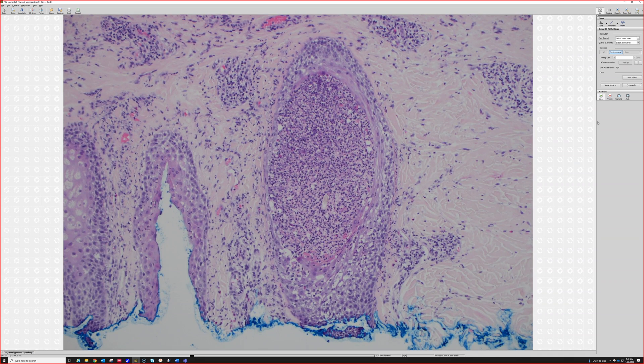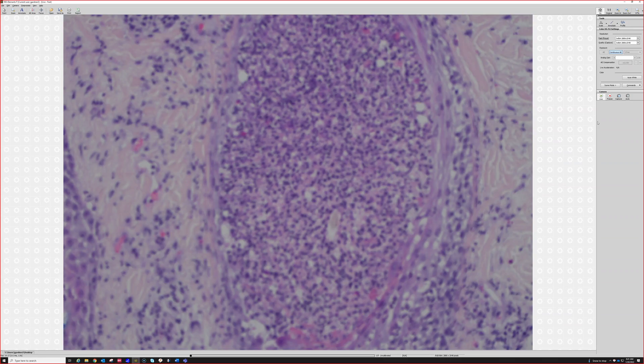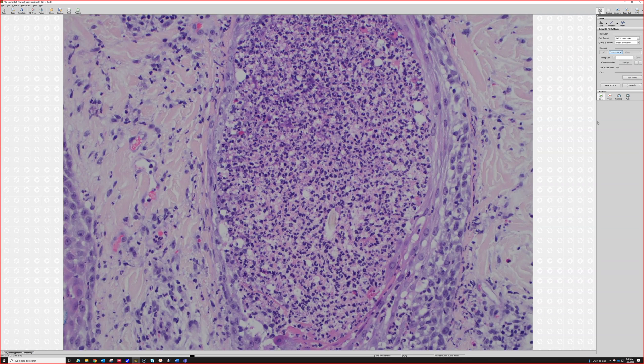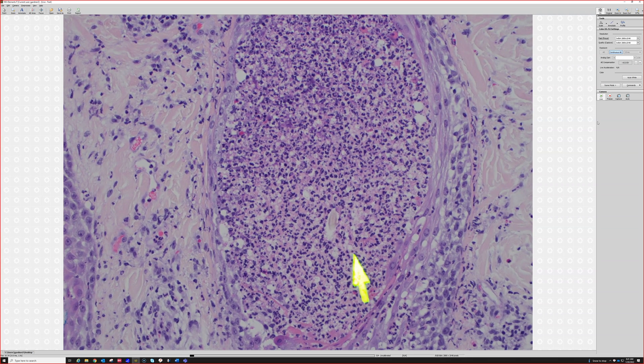We also have a folliculitis. We've got a pustule down in the follicle. You can still see the hair shaft right there — a little tiny hair shaft.